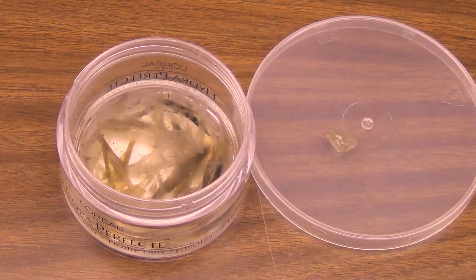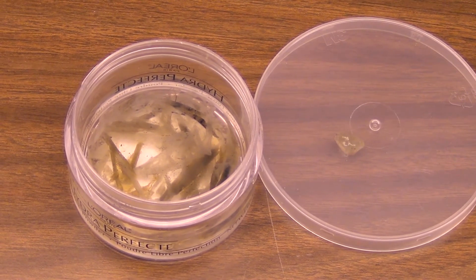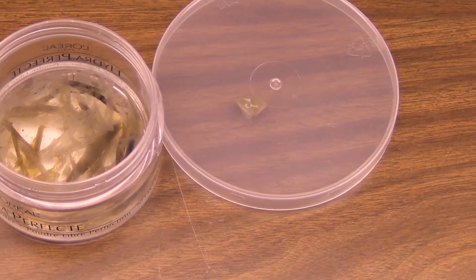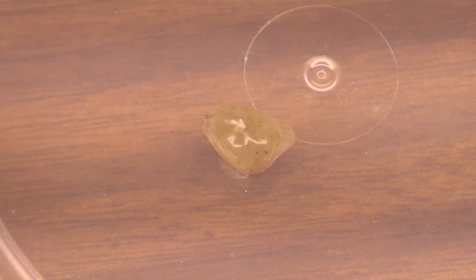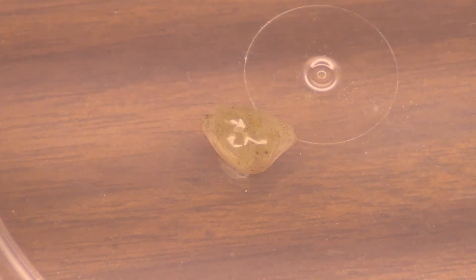There it is. And when it lands on there, it's just like a — let's see if I can zoom in here a little bit. That's pretty much all I can do right there without it having focus issues, but we'll let that dry a bit and see what that looks like.